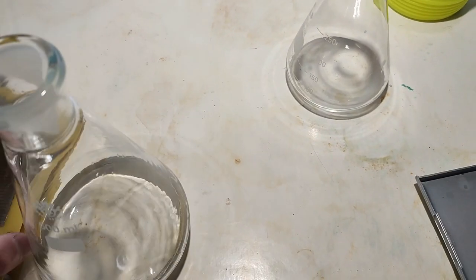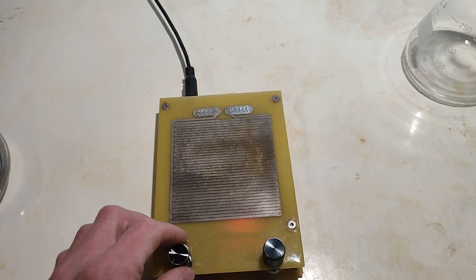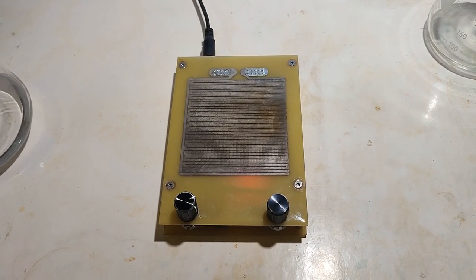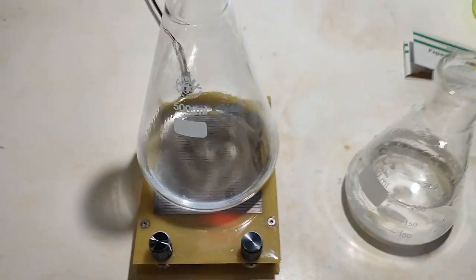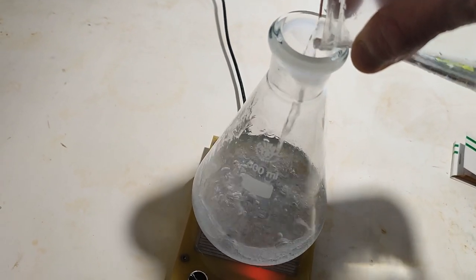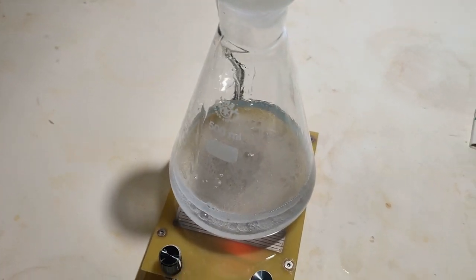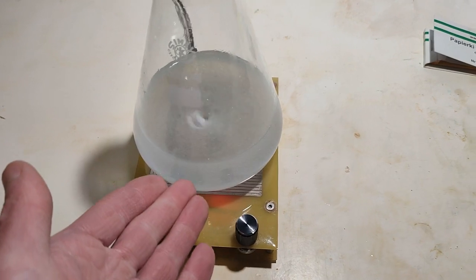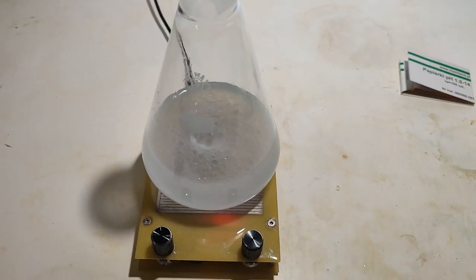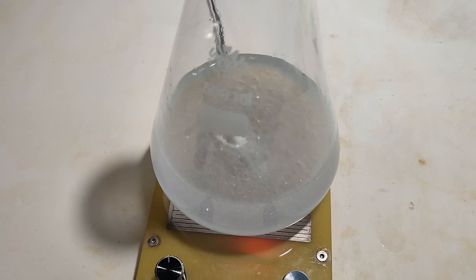Very nice. And since we are doing this at low temperature, I will use this hot plate, which is a little bit experimental, but I have PID for the motor. Yay! It's very good, actually. Alright, so here goes a bit of water. It's probably good enough. What I should have done is weigh the methacrylate and then calculate how much sodium hydroxide I will need. For 100 grams of methacrylate, I will do that off screen, but I will add just small amounts, some 10 grams or something like that, and I will be adding it periodically.